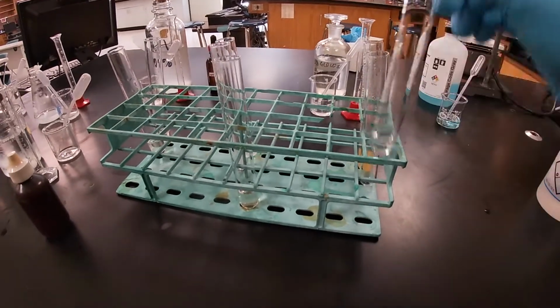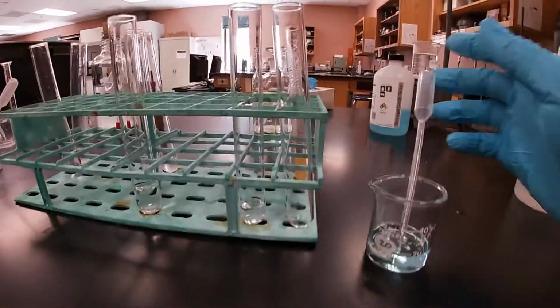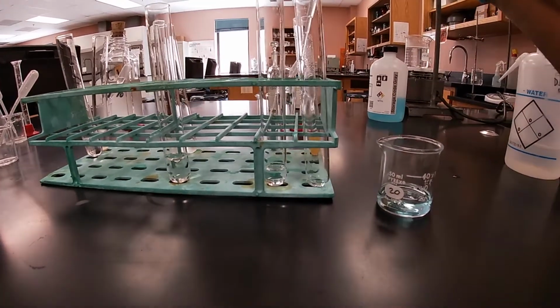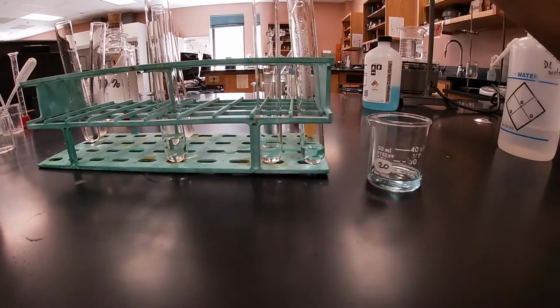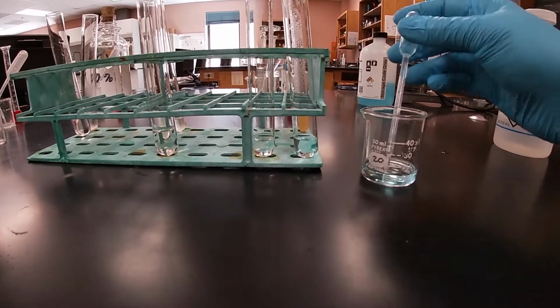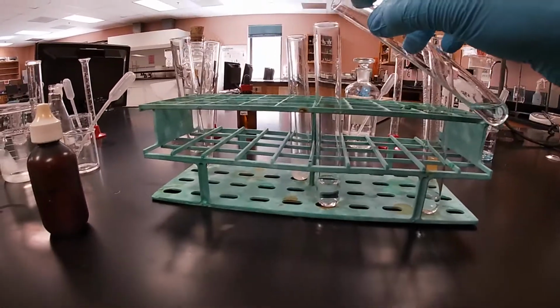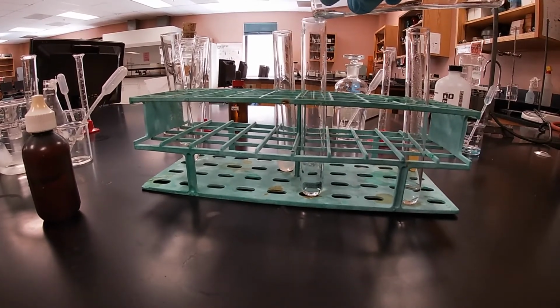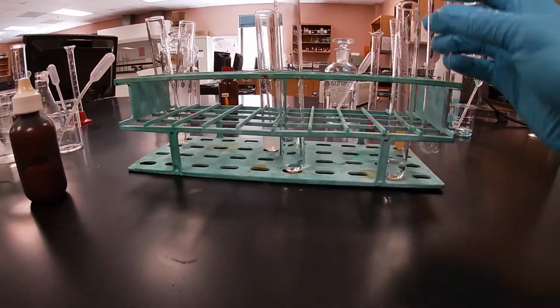And we already have our 3 milliliter standard. So we're gonna get our Benedict's test tube. And as you get it, we're gonna measure out using our standard of water, about 3 mLs, and place it into our beaker. Once we have our solution of Benedict's, we're gonna add it to our mixture, and then apply it to our boiling water bath, right?